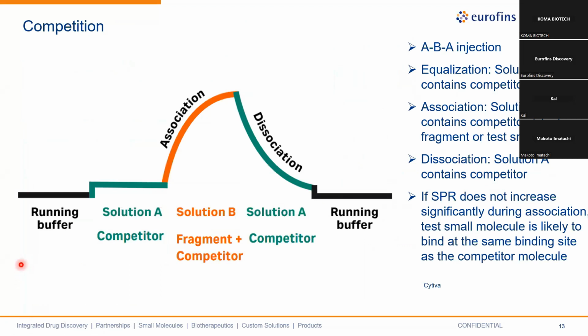Here we do a little bit of introduction of how we do the competition assay. The SPR instrument we have, the Biacore, has a very smart module that can run the ABA injection that can be used for the competition assay.